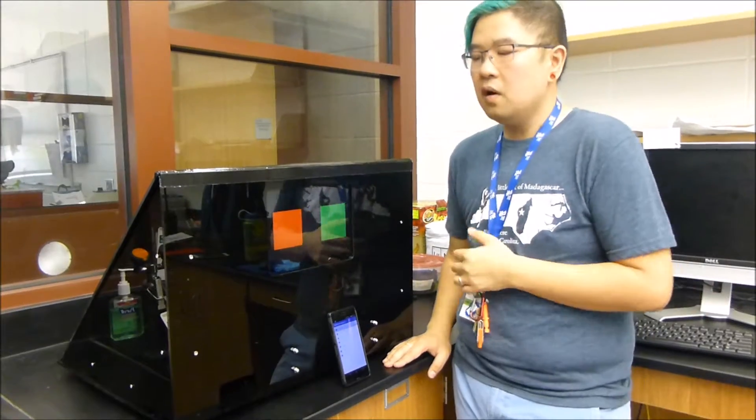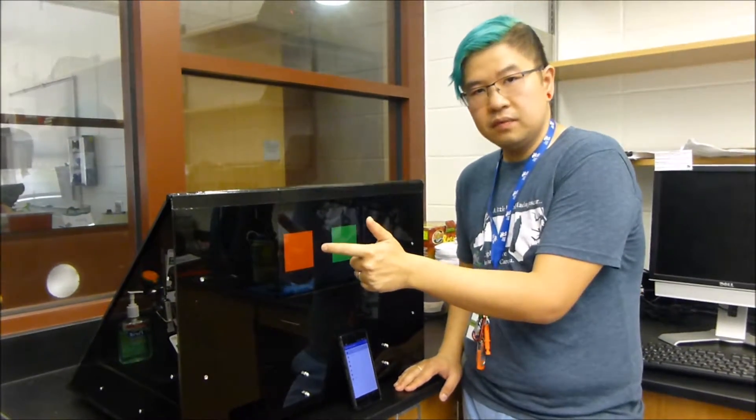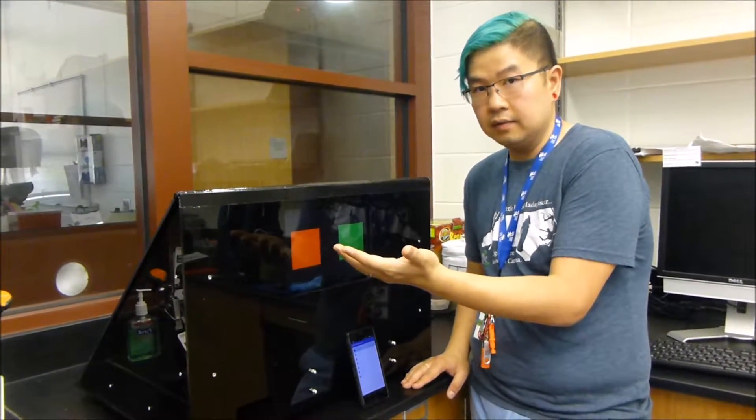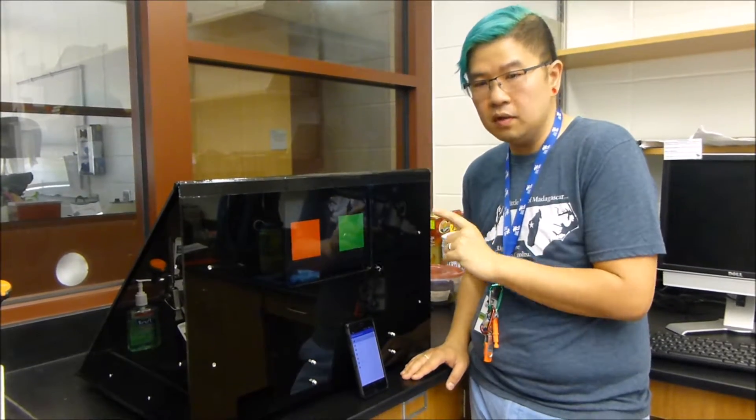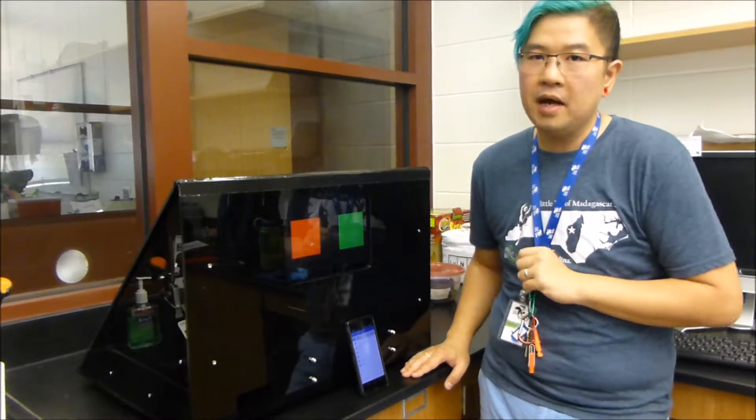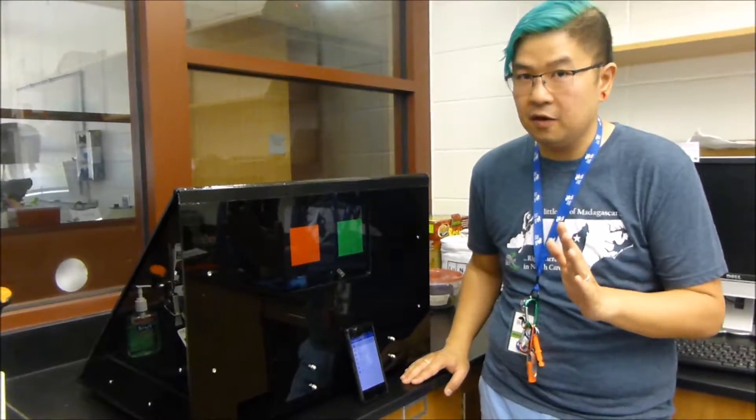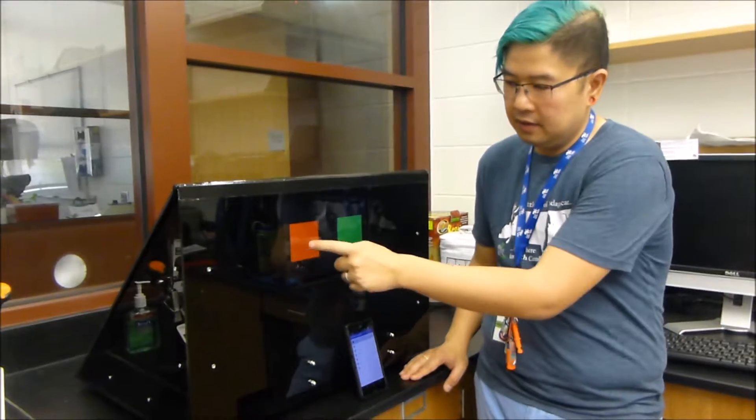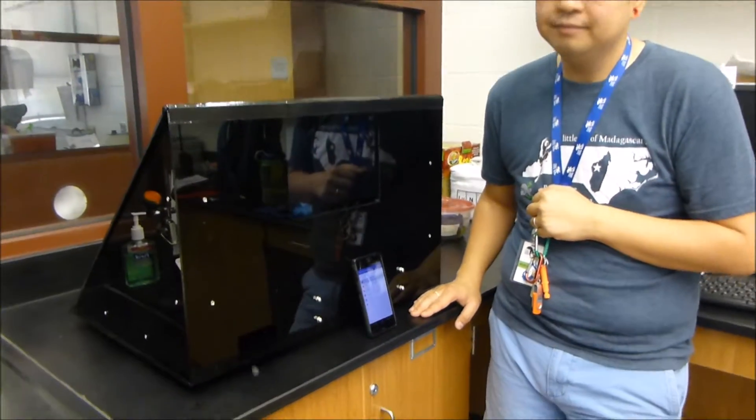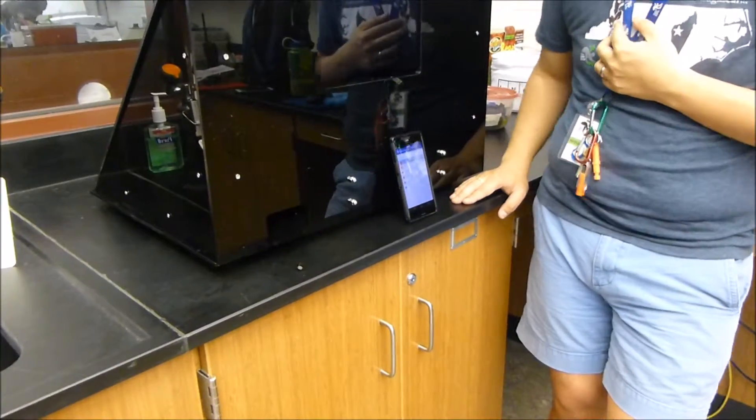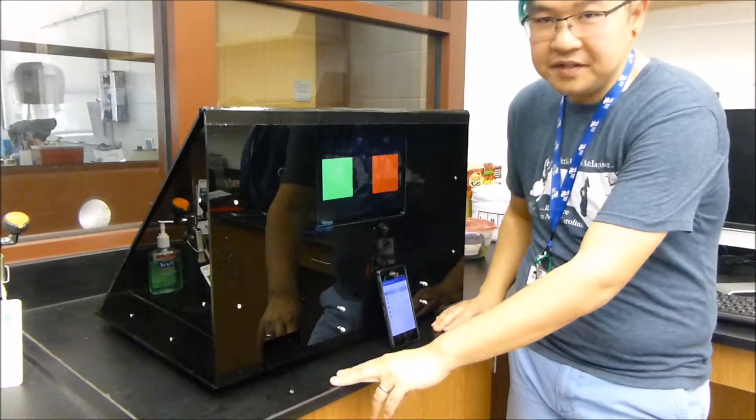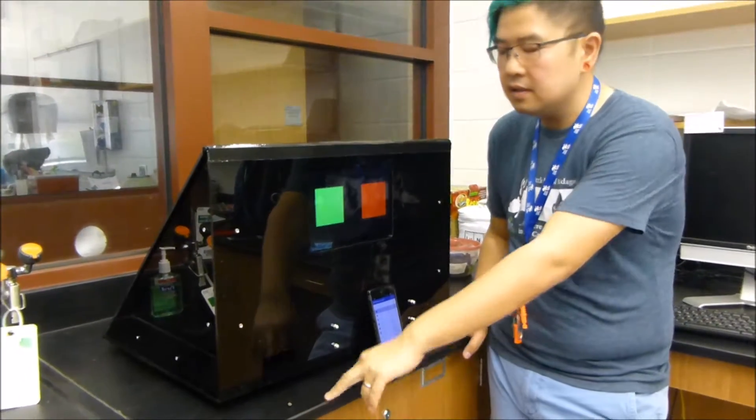All right, so if you touch the red square, which is the correct choice, you're going to hear a whistle, and the food reward will come out automatically. And then it waits five seconds for the animals to eat.